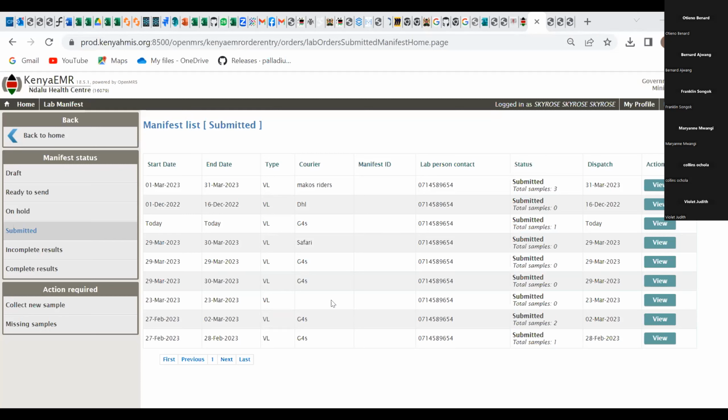That's the question. And then there's also a question asked by Peter, which I think you can probably take together. One of the remaining manual processes in viral loads sample networking is that when working samples for shipment, you are required to log in to the reference lab to pick the allocated batch numbers. And remember, the batch numbers are allocated erratically, such that clients in one manifest may have different batch numbers. Is it possible for Kenya EMR to pick these up?